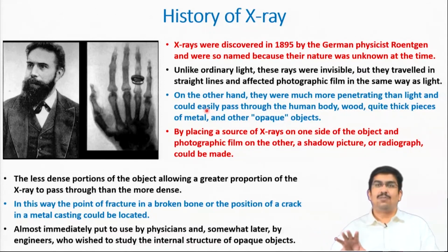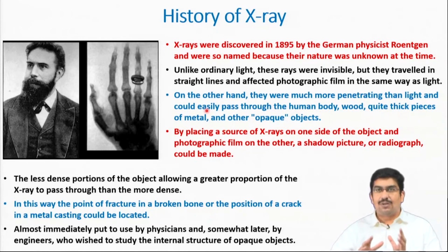X-ray imaging is basically what we know as CT, computerized tomography, X-ray micro CT, which is very widely used for medical purposes, and sometimes for material science as well. So, for scientific and research purposes, this imaging mode, the micro CT or CT mode, is also becoming pretty popular. That is nothing but a kind of imaging only. And then you have something called radiography, which also is quite popular. You can virtually say this is all an imaging mode of the X-ray signal.